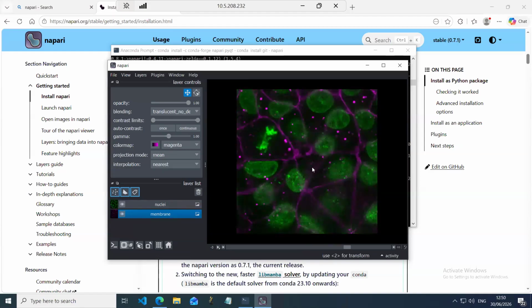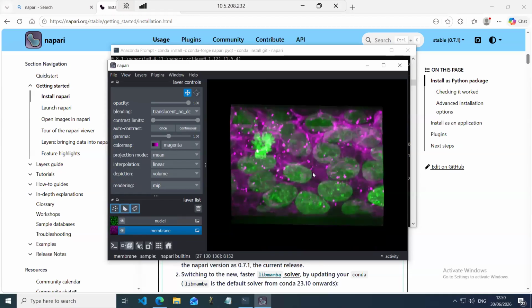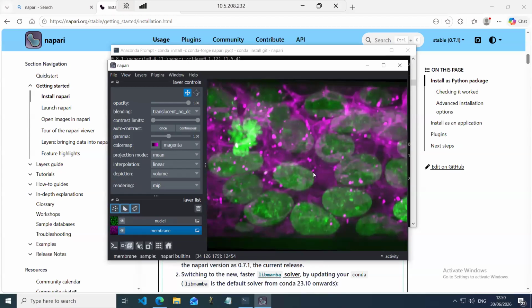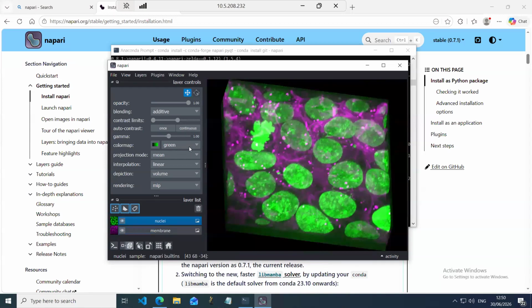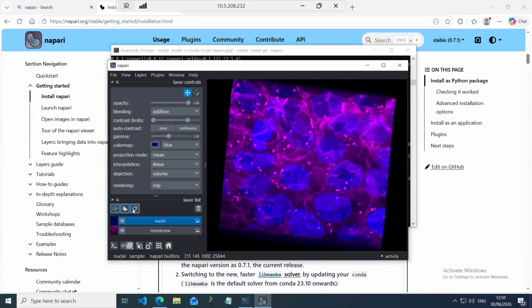Now, with these tools, we make visible different layers so we can go through the Z stack, or we can visualize in 3D the object, and I'm using now the mouse wheel in order to zoom in, or clicking and rotating in order to explore the data set. At this point, we can change, for example, the brightness and contrast here with contrast limit in order to highlight features. Actually, this does not modify the underlying data. Or eventually, we can try to use a different lookup table for the object.